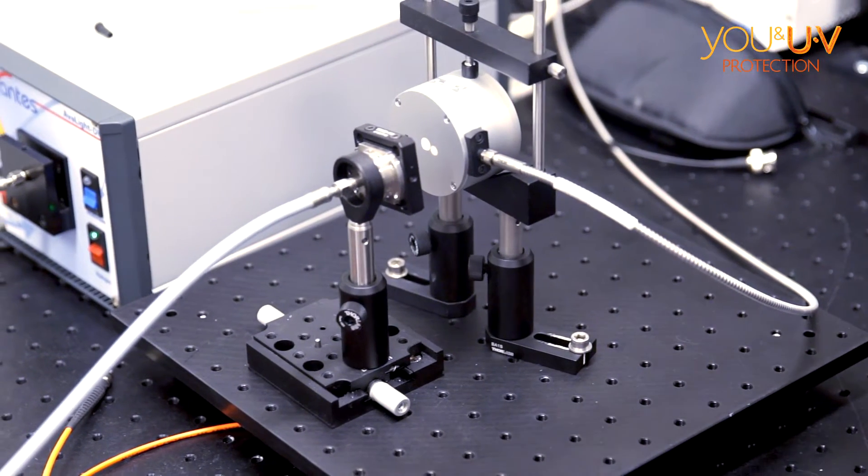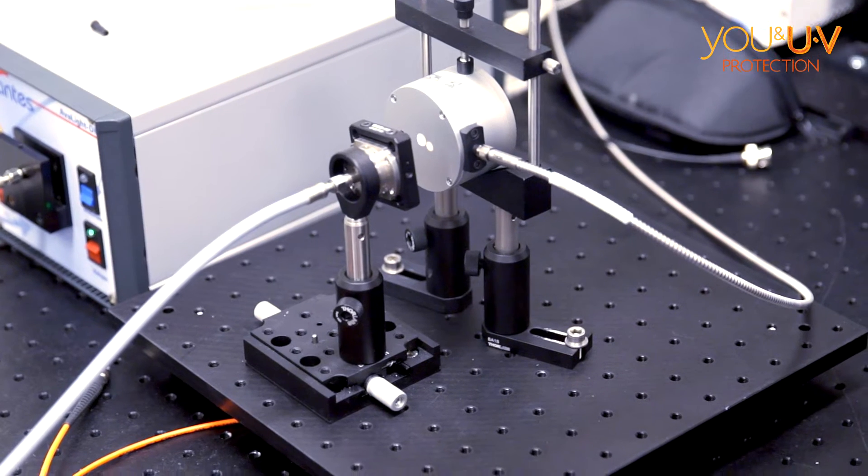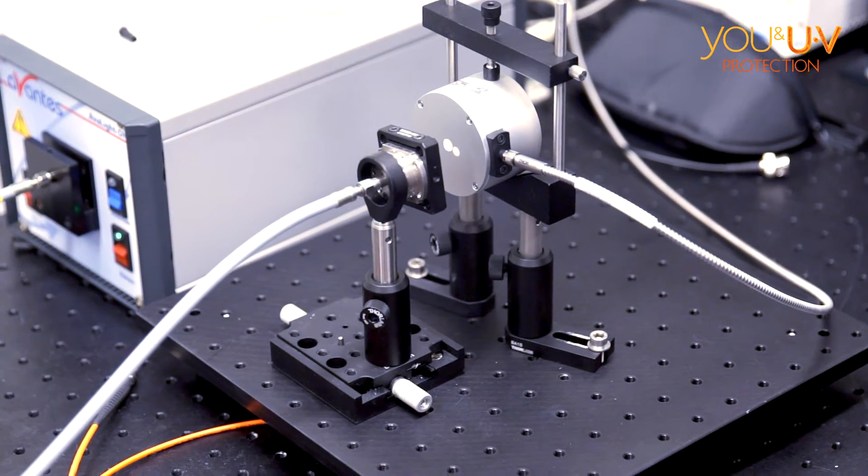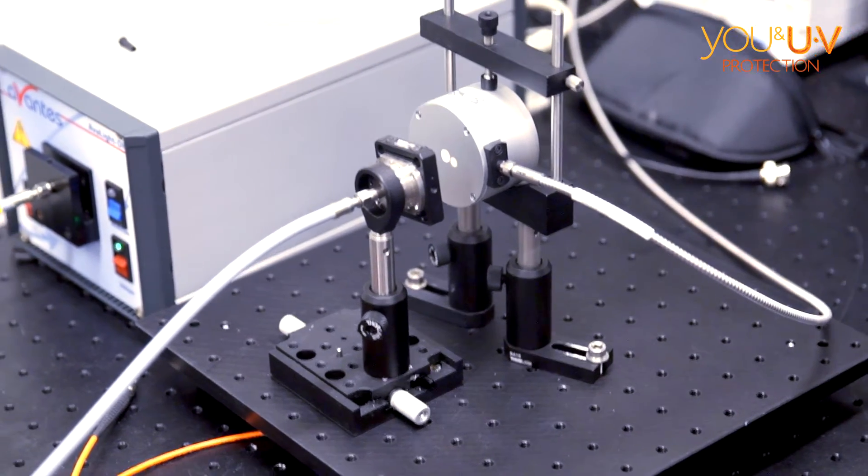This hole is called an integrating sphere. Inside it's completely white, and it reflects everything. In the UV it reflects a lot, but they're not perfect reflections, but it doesn't matter because you do a reference.